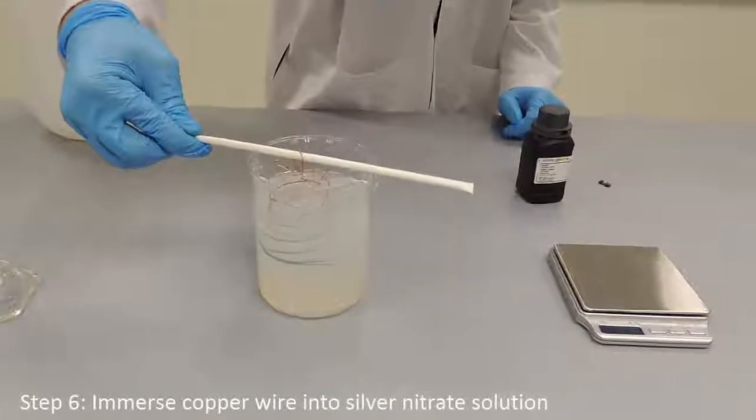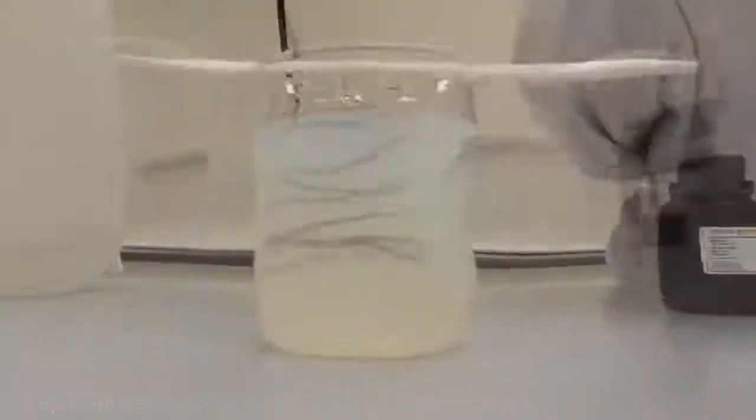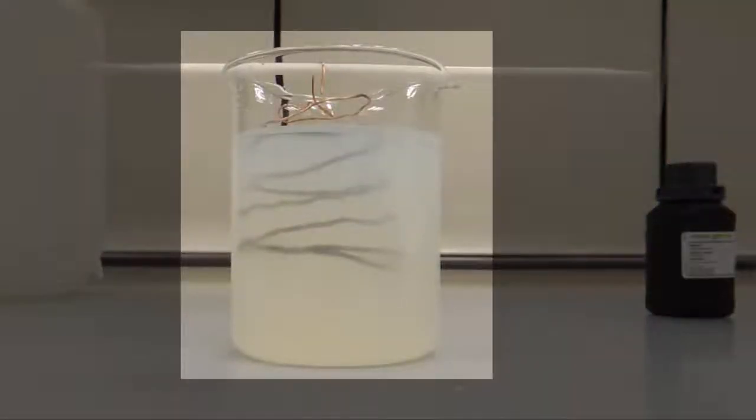Finally, the last step of the experiment is to immerse the copper wire into the silver nitrate solution. It is advised to leave the experiment undisturbed. Let's watch the experiment over time.